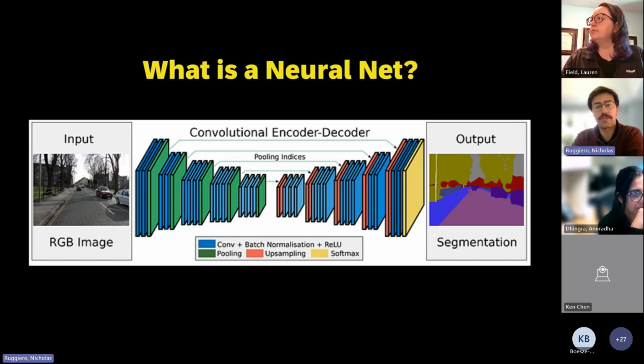For example, the first time it runs through with random weights, it might be 25 to 35% off, something along those lines. So it'll say, okay, I didn't do a very good job. Let me try again. It will change the weights in our neural network and run through again. The second time it does it, it might only be 20% wrong. So it says, okay, I'm doing a little bit better. And it will continue that process again and again until it approaches some value that is very close to what we actually want.